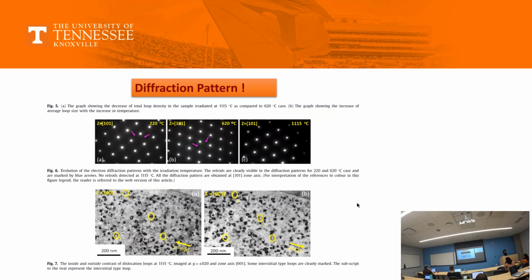Okay. So this was one of my papers that I published, I think, in 2018. Here it was published in Acta Materialia. And you see that we see dislocation loops. And in the dislocation loops, on screen, you see the pattern that I drew in the previous slide, which was more like a parallelogram in center, right?